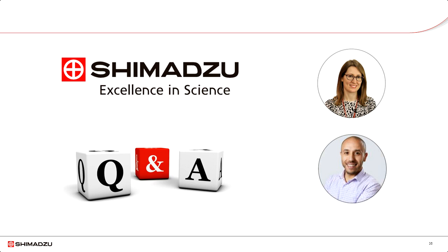Moving on into the application, we have one question regarding the milk application, and the question reads, regarding the milk application, why was it necessary to digest the sample prior to analysis? Could you not detect the difference by analyzing the intact proteins? Simona, I'll take this answer, because actually the note was developed by my group.